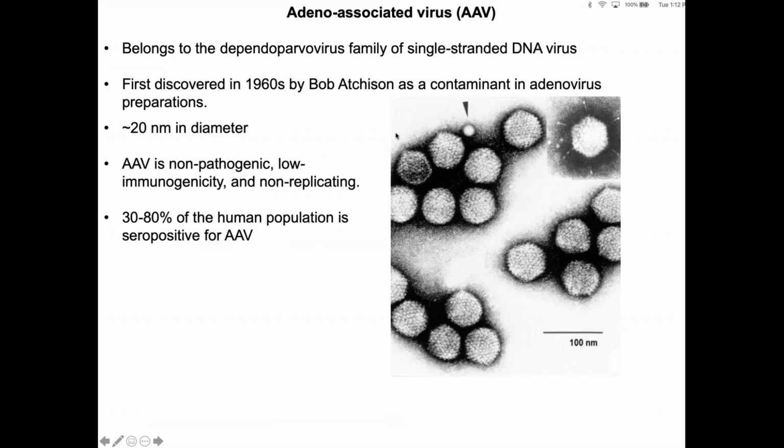So as I was saying, we've been using PacBio sequencing for about 4 years now on several projects that involve the development of CRISPR-Cas9 AAV-based gene therapy applications. And so before I go into how we've been using SMRT sequencing, what I wanted to do was to give a little bit of introduction to AAV, or adeno-associated virus, for those in the audience that aren't really familiar with these promising vector strategies for gene therapy.